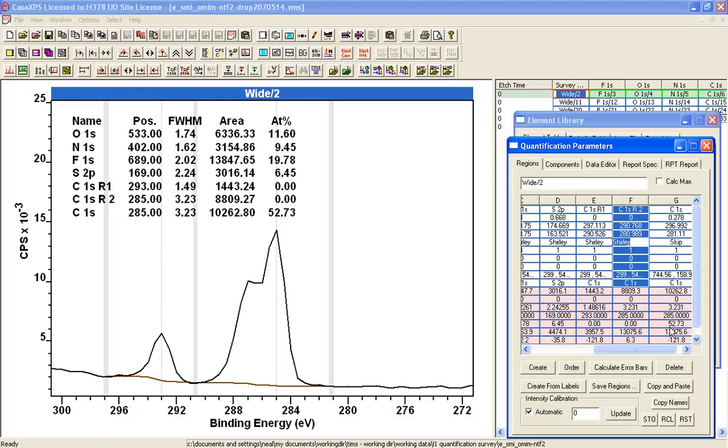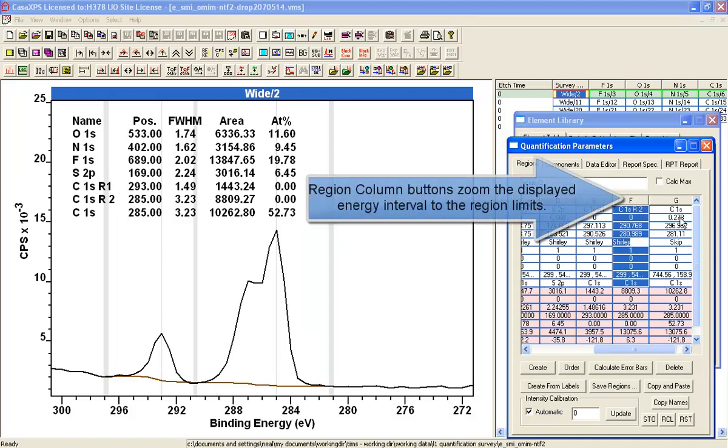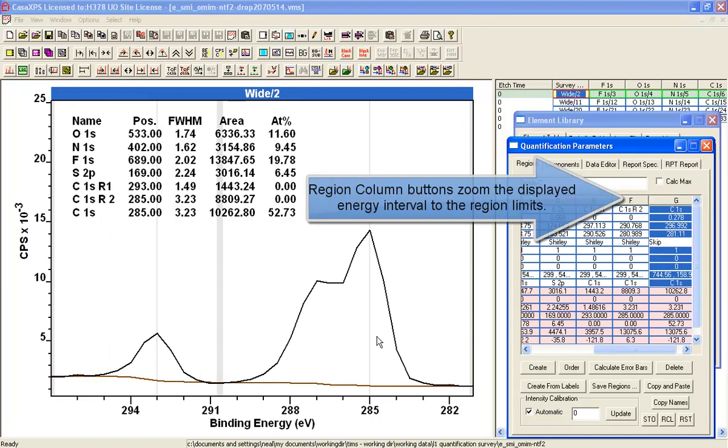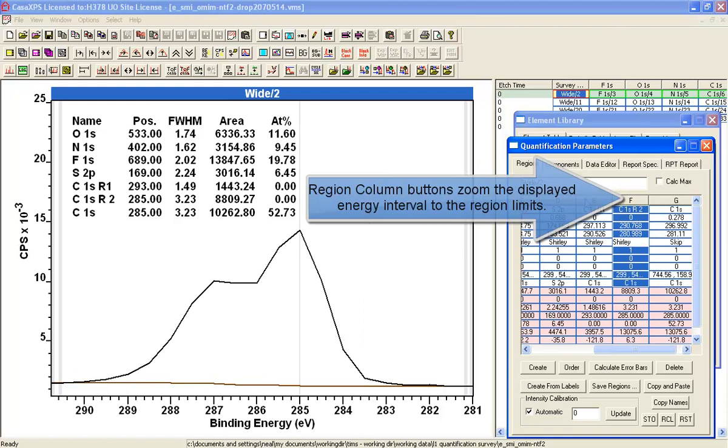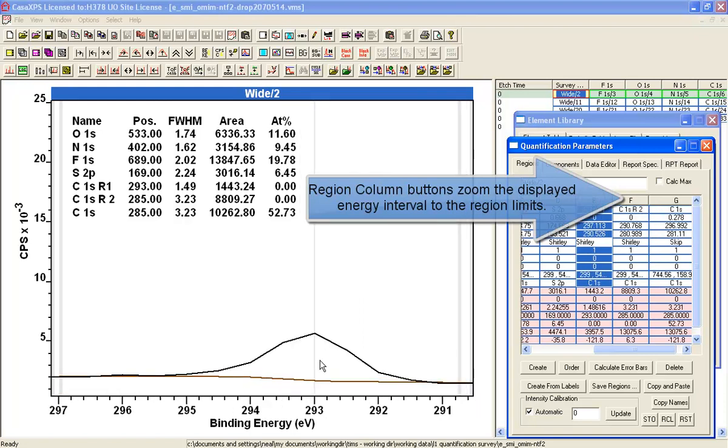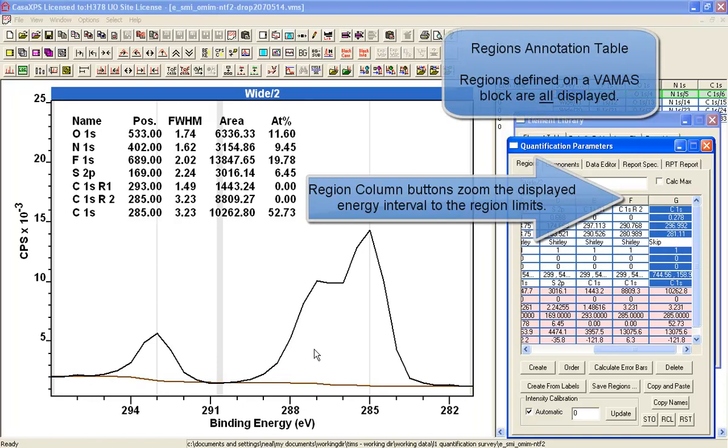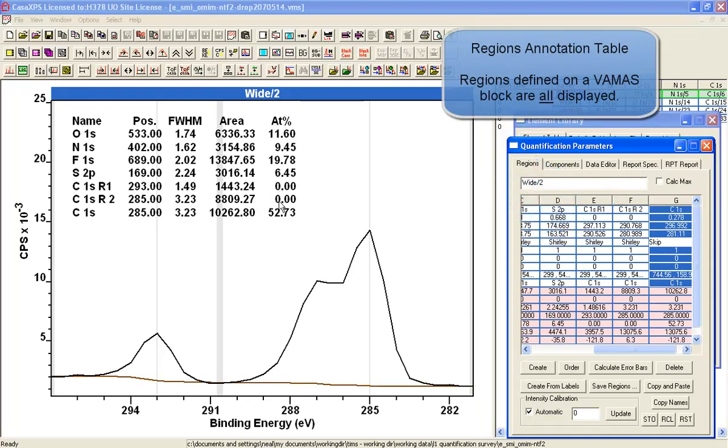So we now have the amount of carbon is now deriving from this skip background region that is across both. So if I click on where it says G, it'll zoom. And so you can see that's both of them. If I click on where it says F, it shows me the one part of the peak and there's the other part. So G encompasses both. So now you can see the report. And here, because this is a regions report, it's actually showing all the regions even though we've got zeros here.